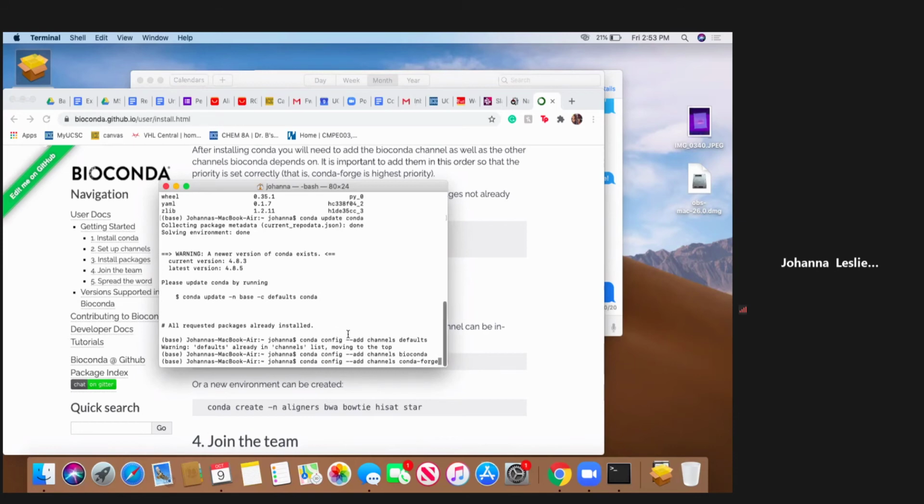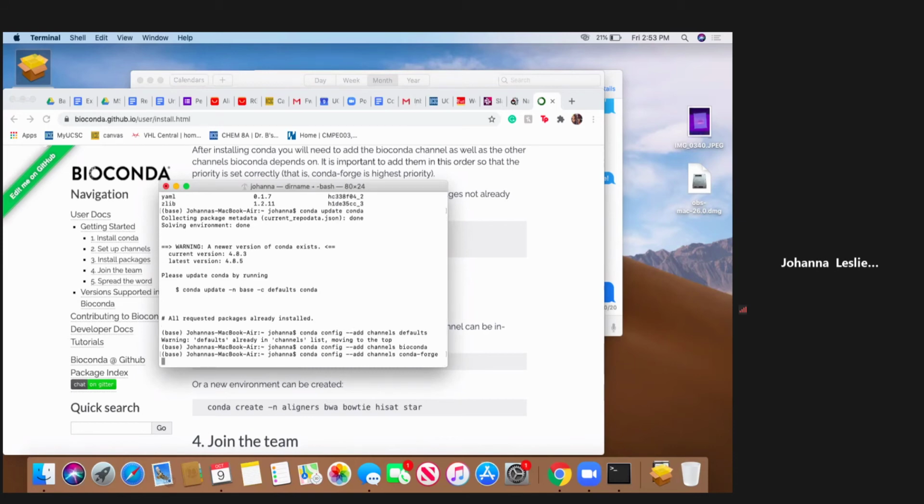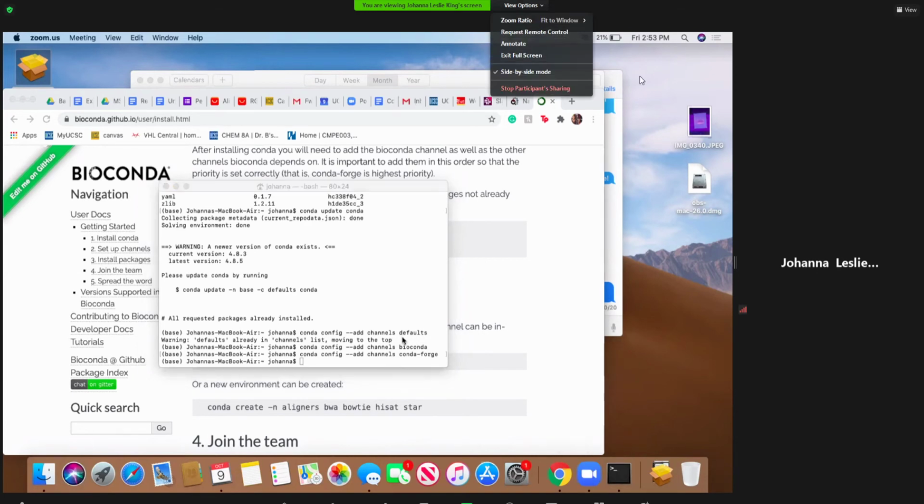I think, is that it? Hit return one more time. There you go. So now you are up to speed with everybody else. Cool, thank you. Awesome. Let's stop sharing my screen. I'll do it for you.